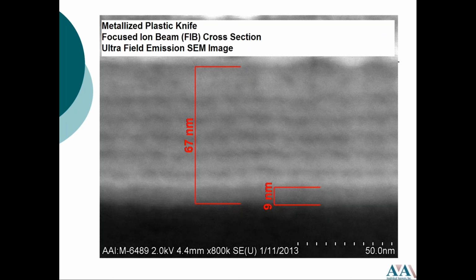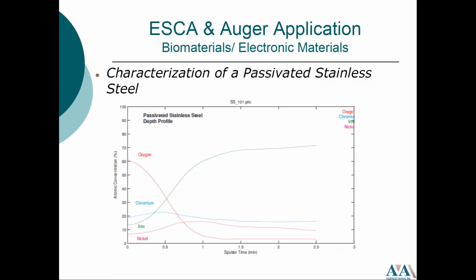So here we have that oxygen and chromium are the major elements on the surface of this stainless steel sample. And that's important because what makes stainless steel stainless or rust-free is that chromium content. Stainless steel has 12 to 17% chromium, and that percentage of chromium preferentially binds to oxygen and creates that passivated layer on the surface.